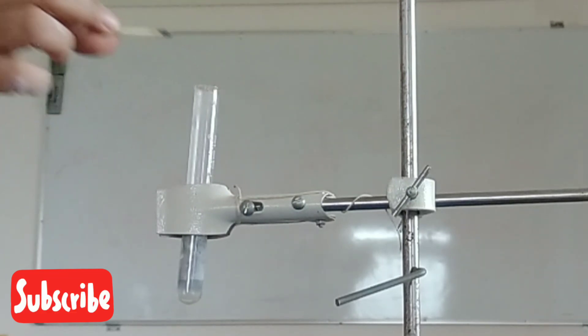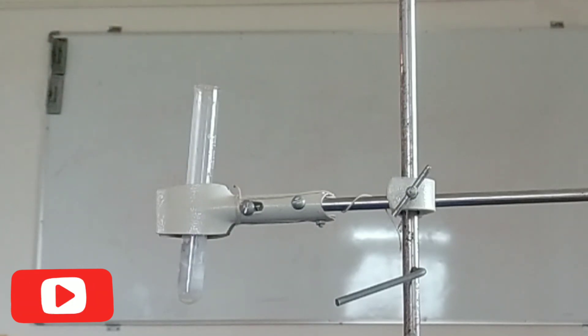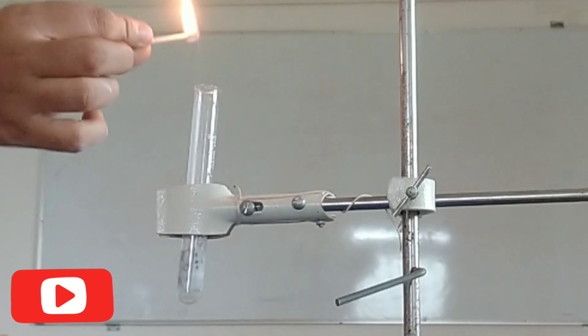When the lighted match stick is brought near the test tube, the gas burns with a pop sound. This gas that burns with a pop sound is hydrogen gas.